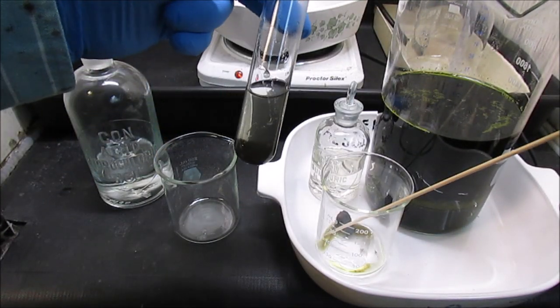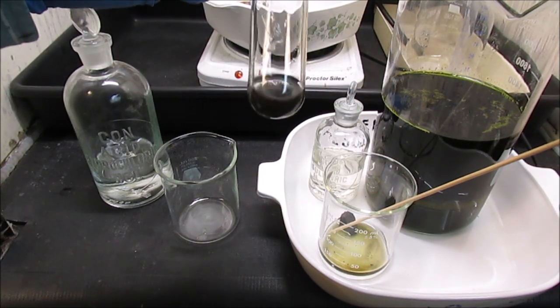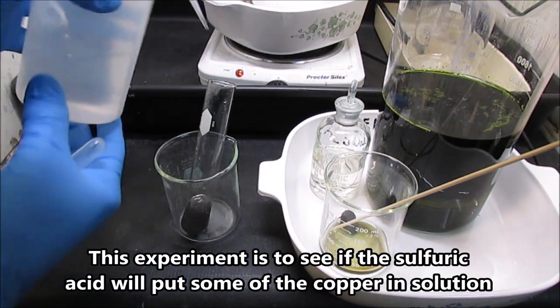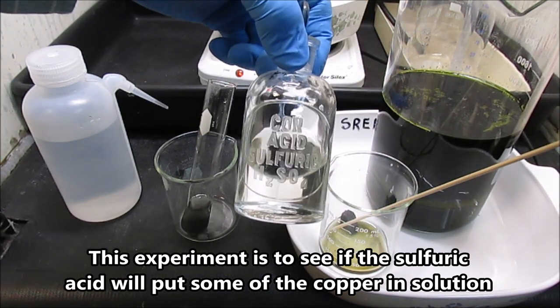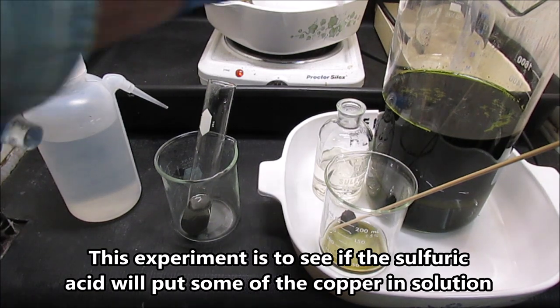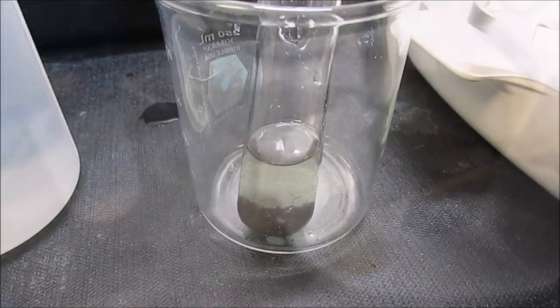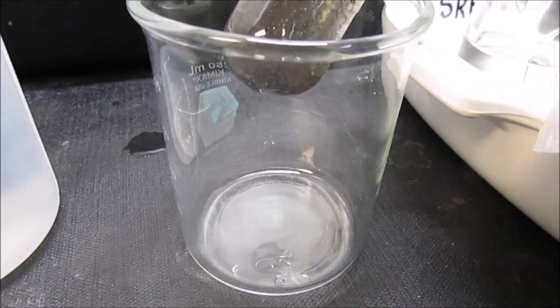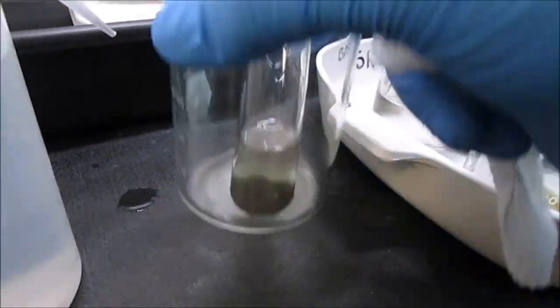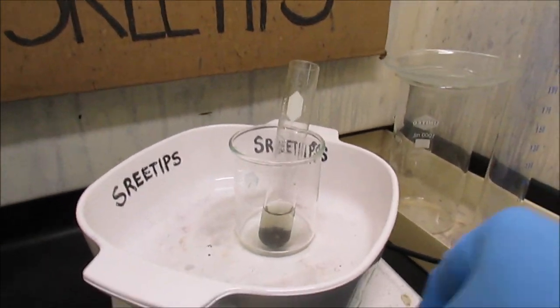Now I've got my solids — I'll just let that settle out. I'll pour the liquid off. Now I'm going to add a little bit of distilled water and a few drops of concentrated sulfuric acid — about half a ml. Let's set this up on the heat and cook it for a while, and see what kind of result we get here.